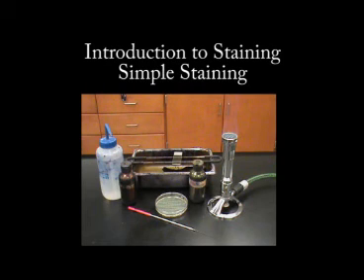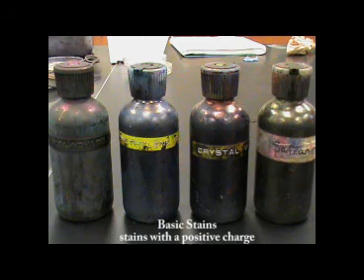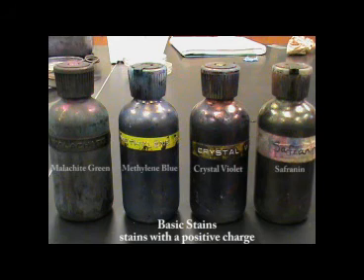Introduction to staining. Using the simple staining method. Bacterial cells are colorless or clear, and staining is used to improve contrast under the microscope so bacterial cells can be observed. The most common staining method is one using what is known as a basic stain. Basic stains are stains that have a positive charge. Bacterial cells have a negative charge, so in simple staining methods, basic stains will adhere directly to the bacterial cells.